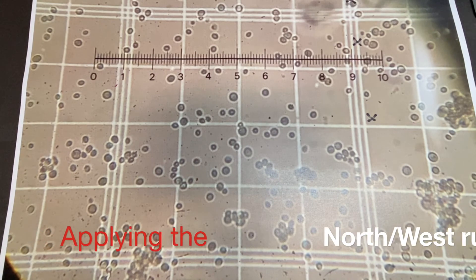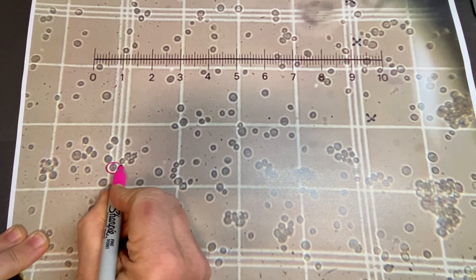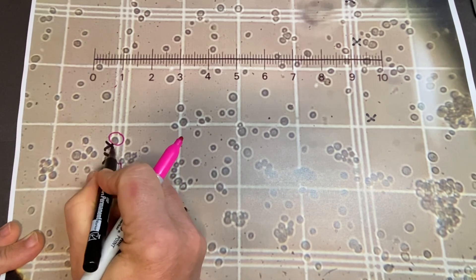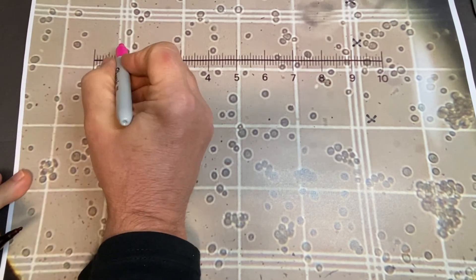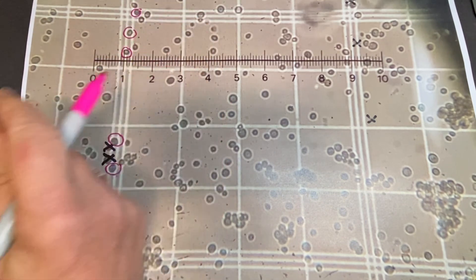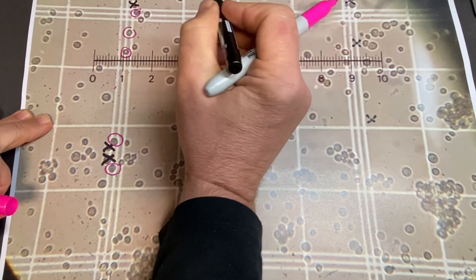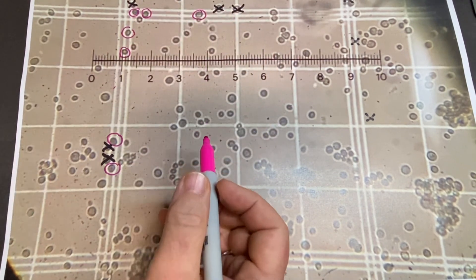Viewing the sample with the 40x magnification objective allows a count of the yeast cells to be made accurately. The north-west rule is applied. This means that any cells overlapping the middle of the three grid lines at the edge of the square are included in the count if they are on the left-hand or upper side of the grid square. Those overlapping the middle line on the bottom or right-hand edge are not included in the count. In this example, the cells included in the count are ringed in pink and those not included are given a black cross.